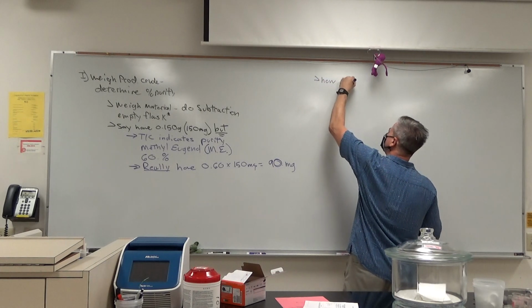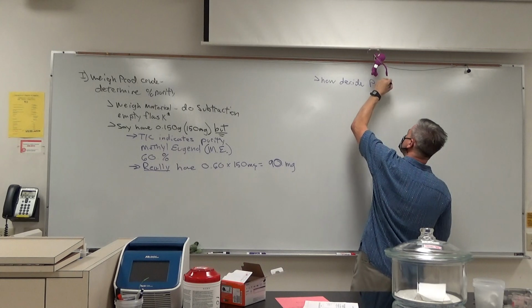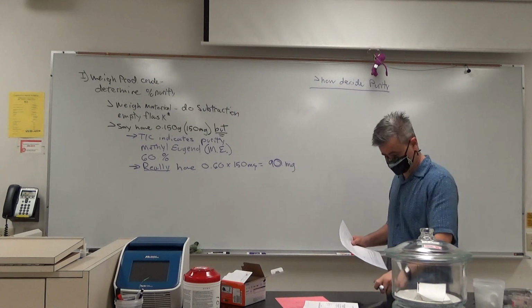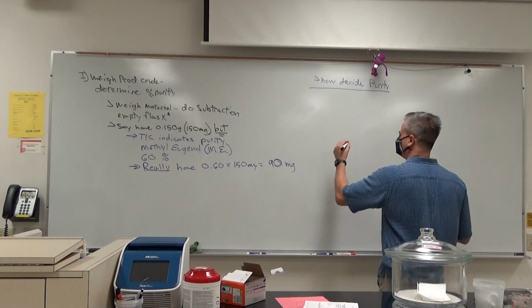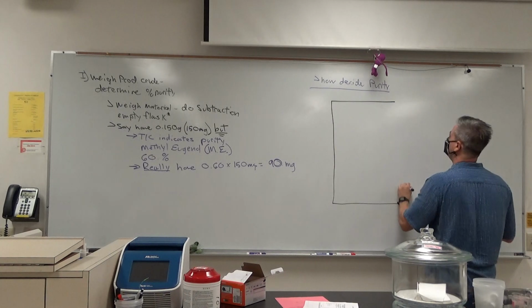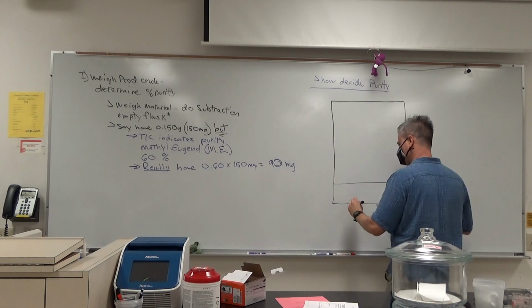But how do we decide purity by TLC? It's going to be a judgment call, subjective for sure, a lot like the one you did for aspirin.